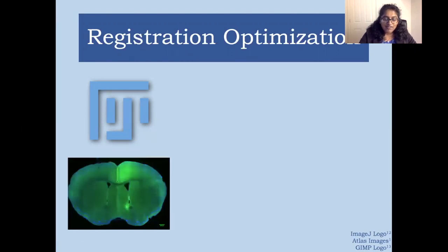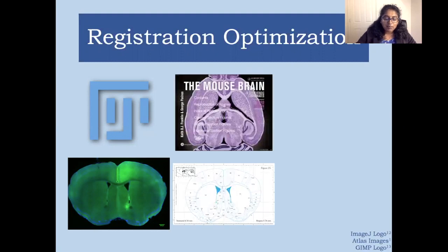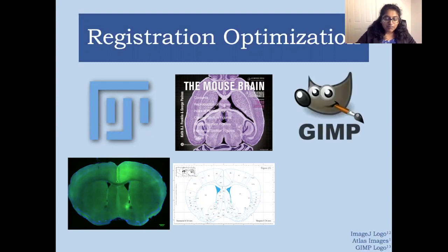So once you have your saved PNG file, you then want to identify the Brain Atlas reference map that corresponds to the image slice using some reference points. We'll identify a couple reference points in just a bit, but this is the reference map that best correlates to the sliced image. Then we want to open the GIMP application, open the saved PNG file right here in the GIMP application, and open the corresponding reference map as an additional layer.